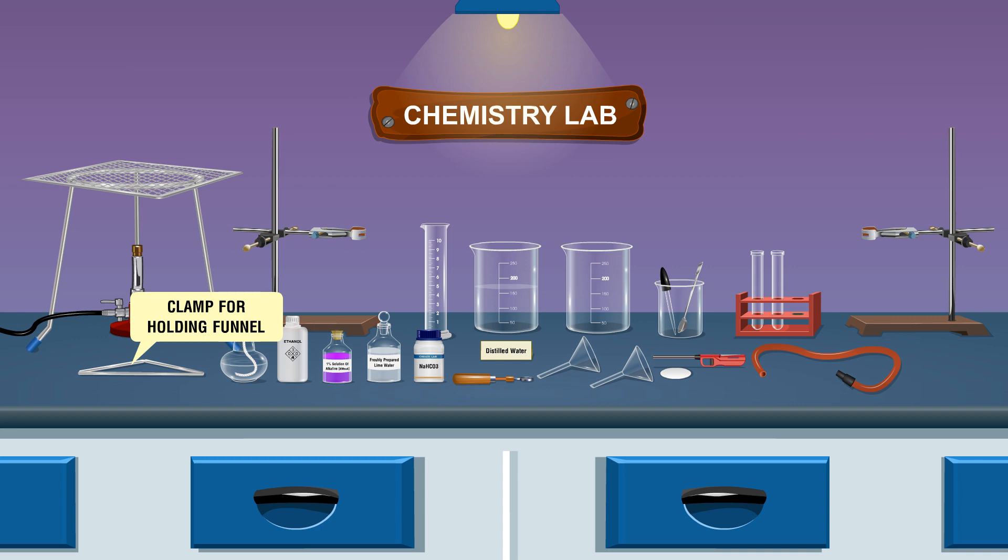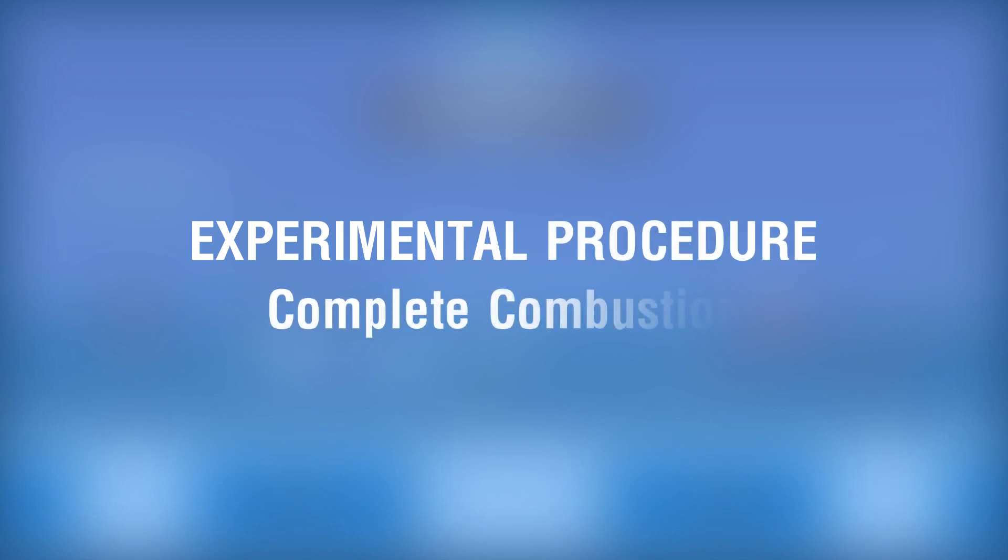Experimental procedure: complete combustion.